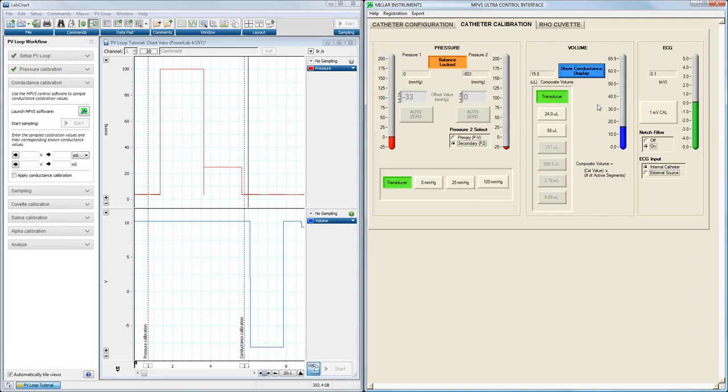So do not use these values for your final analysis. You want to go through and take care of all the corrections that we need to do prior to analysis to make sure we're getting good, accurate data from what we're recording here. We're taking care of all the variables that are there.